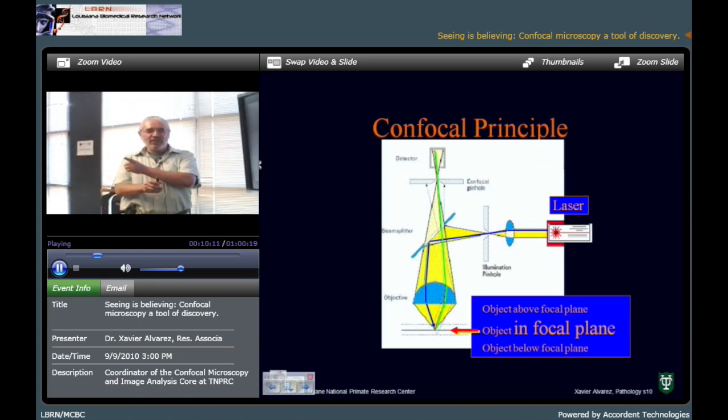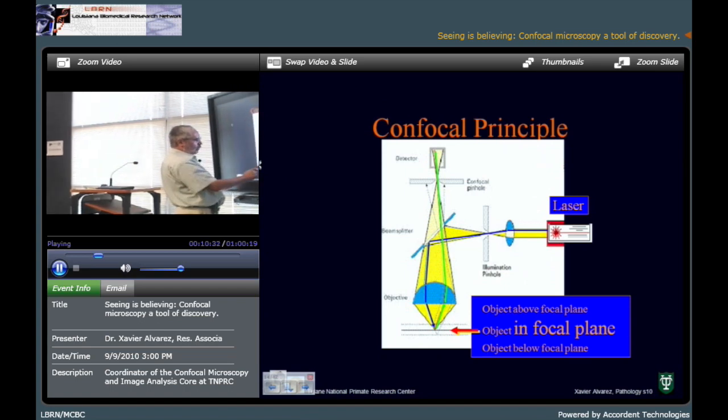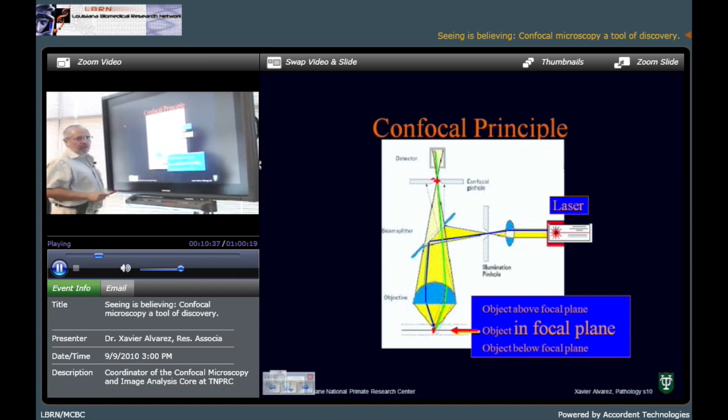Then the relation of these two focuses to the magnifier is that they are confocal, and that's the beauty. You see one point here, and you see another point here only. We shine the light here, we illuminate one point, and then we receive here one point only.